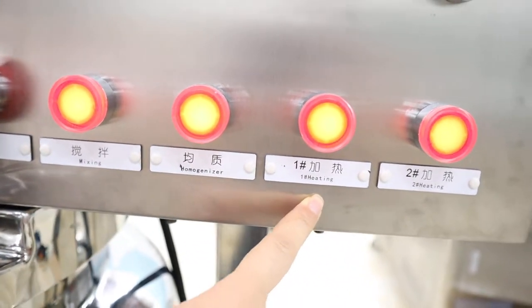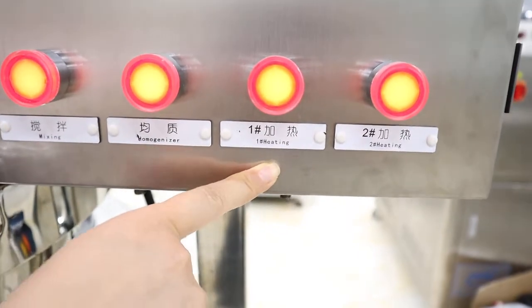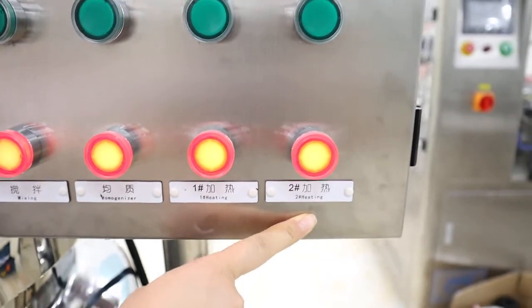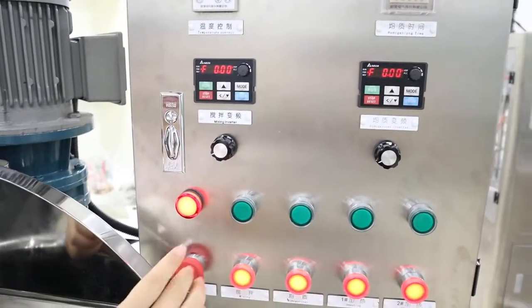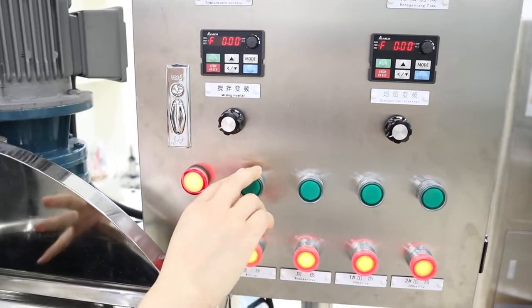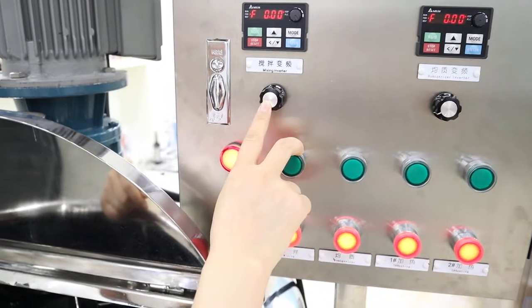This is the heater for the left heating stick and this is for another one. All these functions can be controlled with the electronic box. Here is the change of speed.